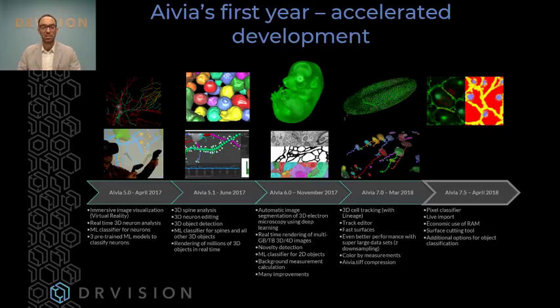It's unlike deep learning, where you may need hours to train an algorithm. In this case, it takes seconds. And so it's a big distinction between those approaches. This is a content-aware feature enhancement. That's why we're calling it that. It's aware of the features that you have in the image, and we can enhance those features depending on the training that is provided.